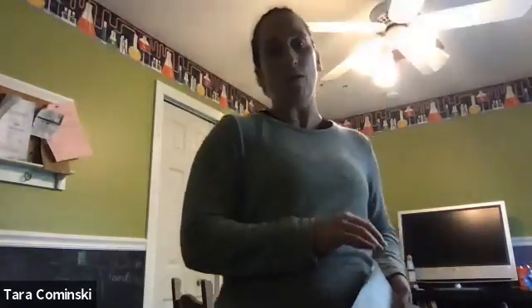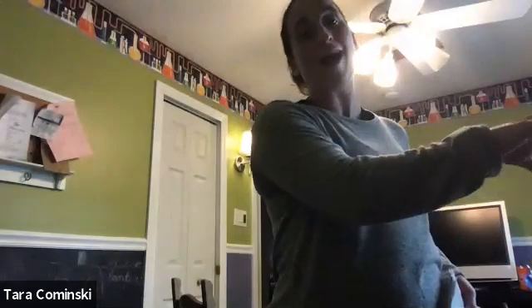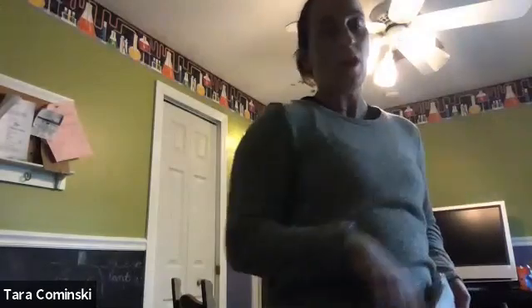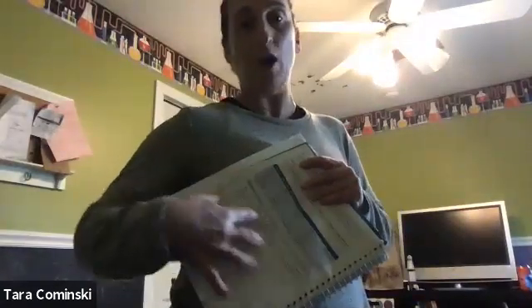I will be zooming in on what I'm doing and telling you guys what the measurements are and things like that. Also, when we get to the microscope part, I will be using my phone video so that you guys can actually see what I see in the microscope, okay? So like I said, I'm not going to pull this up and share my screen. I'm going to tell you, based on the page number and on what the question says, okay? So it's up to you to be following along. All right, so let's get started.